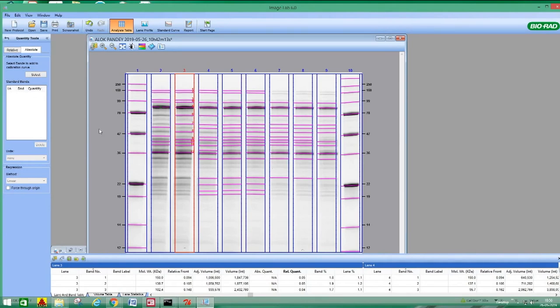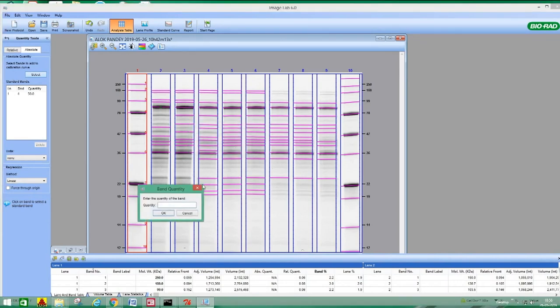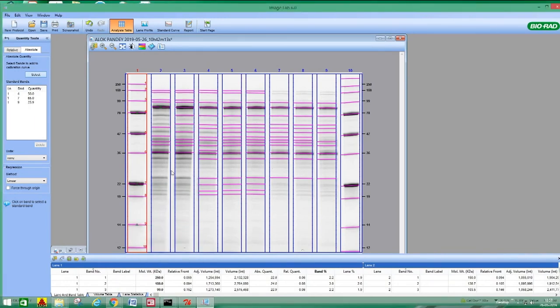At least you need 2 to 3 bands. So see, I am selecting this one. Okay, I am saying this is the quantity of 50 nanogram, and I'm selecting this quantity of 65 nanogram, and I'm selecting another one. This is 25. I mean automatically it gives.